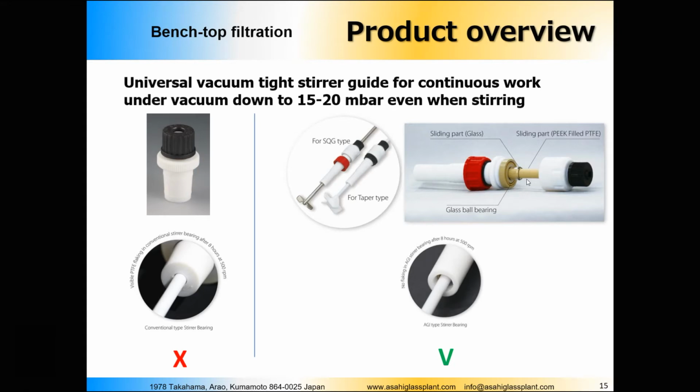Why? First of all, because the PEEK material rubs against this glass tube, and when these two materials rub against each other, no dust forms, so you will get no dust inside your reaction mixture or your slurry.